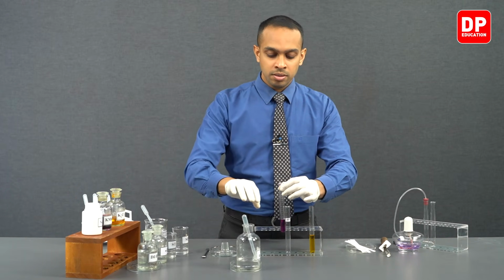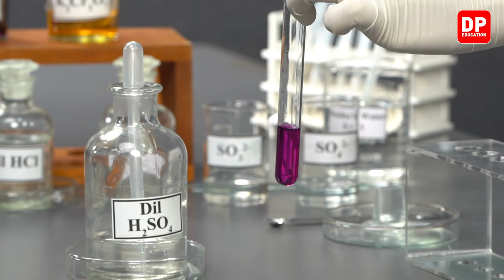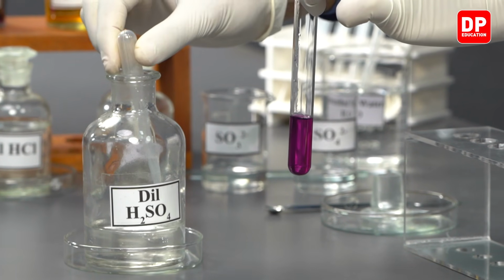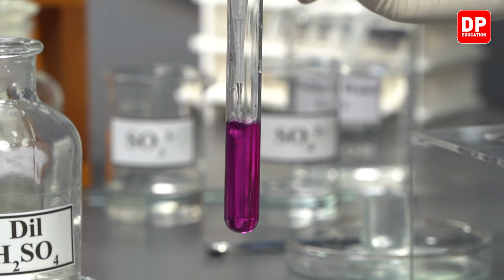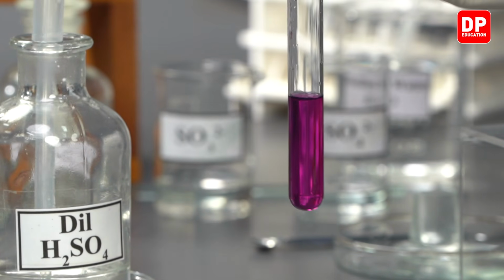And then we are going to acidify this potassium permanganate solution by adding sulfuric acid. So we have our sulfuric acid here. Let's add a small volume of sulfuric acid to acidify our potassium permanganate solution.